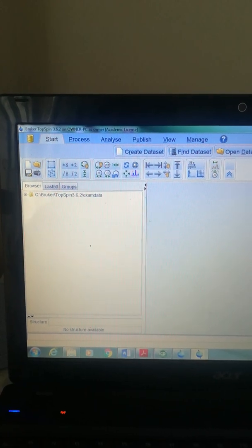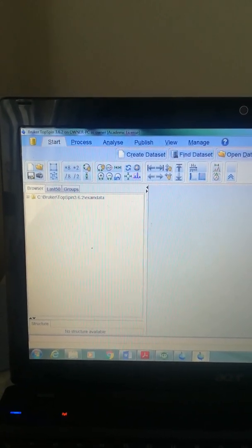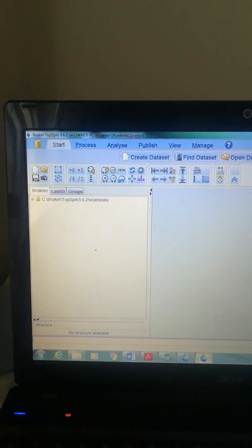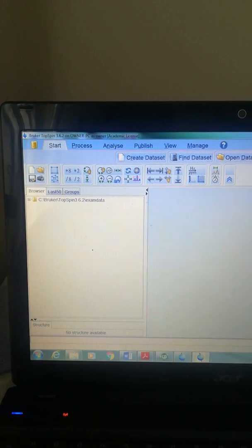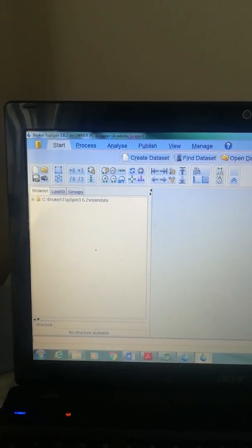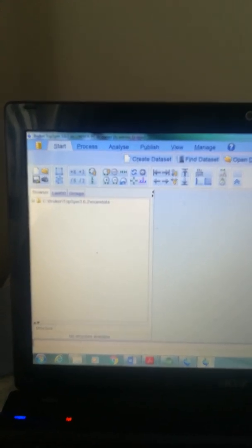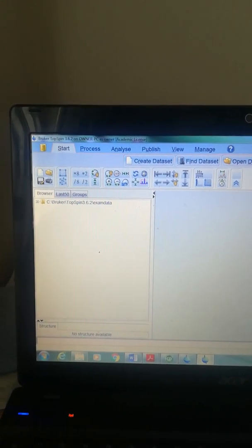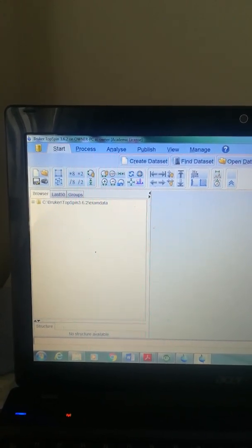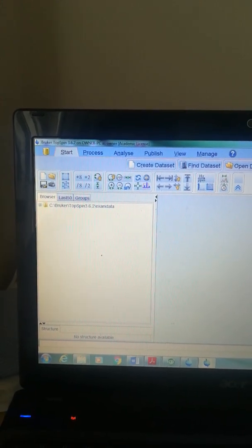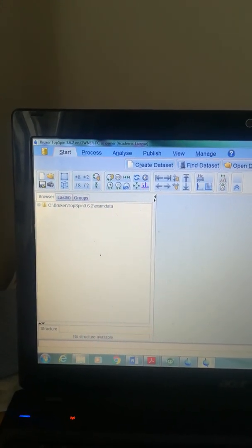Previously we have done proton NMR processing — that is phase correction, peak picking, integration, and some others. We also carried out how to calculate peak multiplicity, that means J-coupling, using TopSpin. This time, it's about how to process carbon-13 NMR and after processing, how to plot it and make it ready for manuscript.